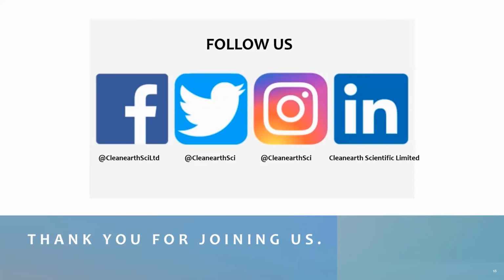One more question from Perfect. It says, how are you able to monitor or tell that the quality of the water being produced by the system is maintained over the period of production or over the period of storage? Maybe assuming that the system has been working for some time, let's say 5 months. How you ensure that this is maintained, like I mentioned during the presentation, is that we have monitoring technologies.